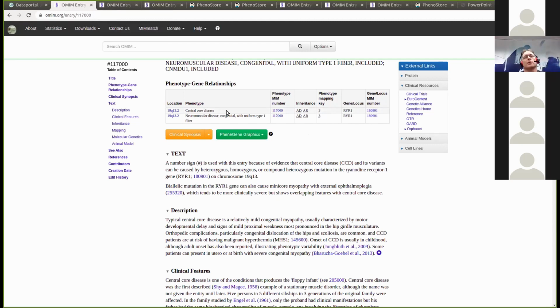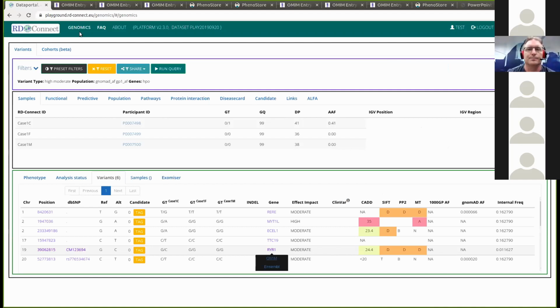So they actually discovered 2 things here. So one, they got the actual disease because they weren't sure before. From the HPO they had an idea of what it could be, but once they knew that it had this novel variant that was damaging the RYR1 protein, then they could confirm it was central core disease, and also they knew what the cause of the rare disease was that the child had.